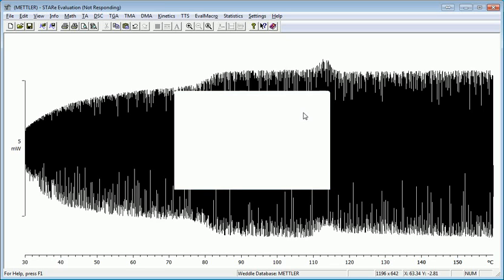Now it does take a while to deconvolute all this data. You see all those cycles that are so compressed. It depends on the processing speed of your computer, the size of your data file, which has to do with the heating rate, and the temperature range that you covered. But you just have to wait for that to deconvolute.